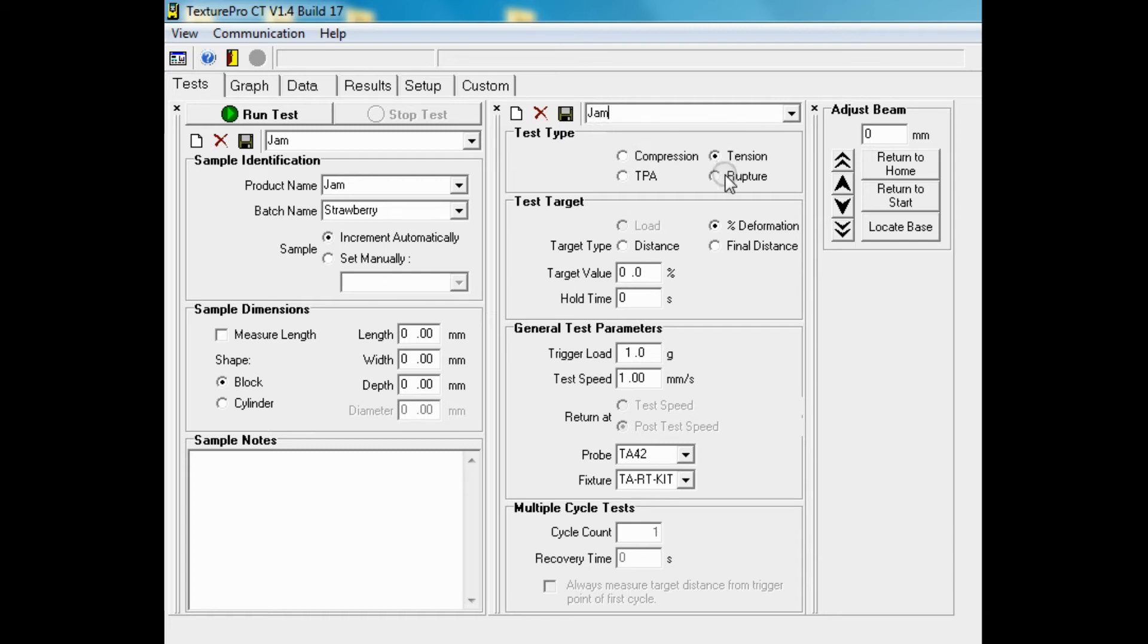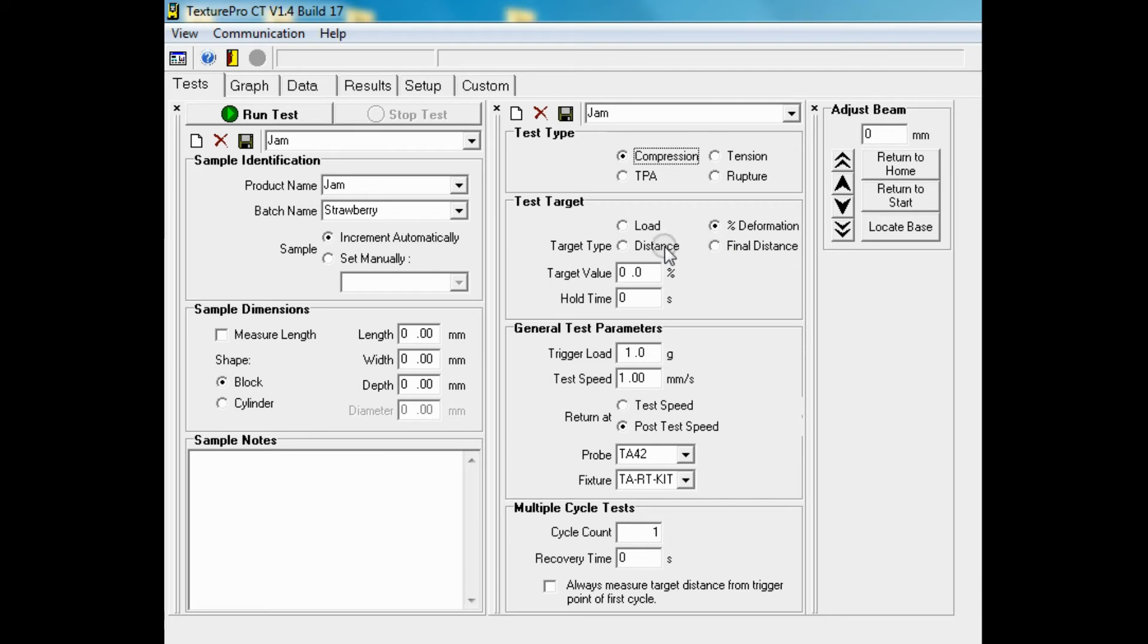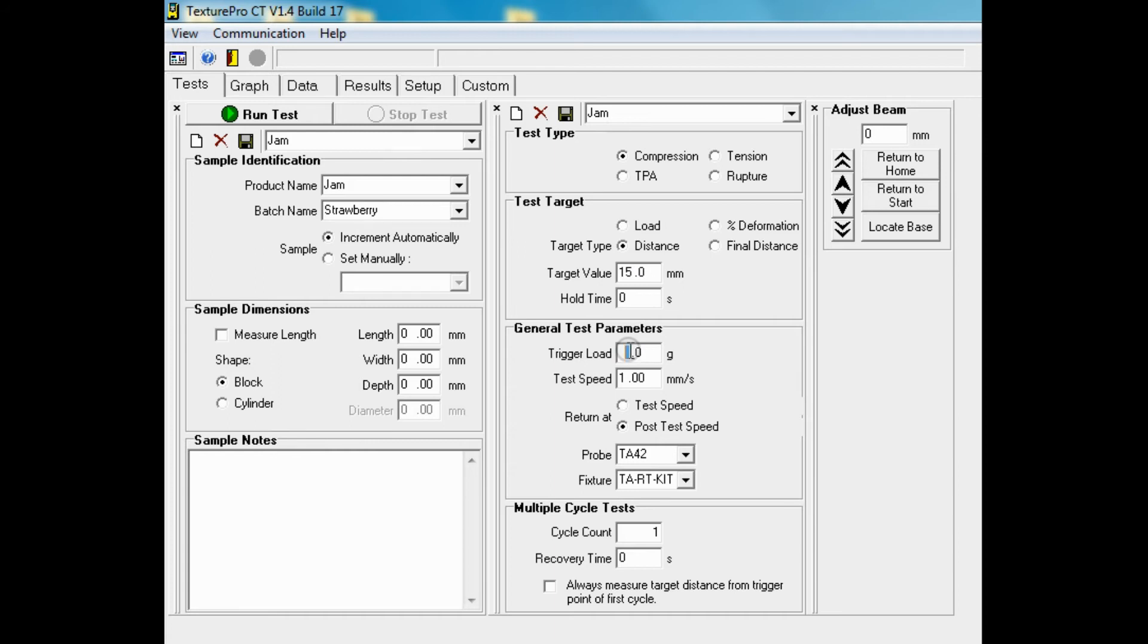The test we are performing here is a compression test. The test target is distance and the target value is 15 mm. We will set a trigger of 10 grams and a test speed of 2 mm per second.